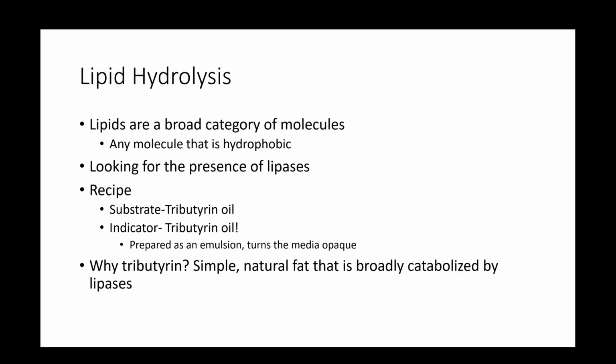Tributyrin also has a really nice aspect to it. Remember that all lipids are hydrophobic, and our media, of course, is made of water. So if we add oil to water, it's not going to mix. If we were just to put it in there and pour our plates, we would have a mess. We would have media solidify, and then we'd have oil floating on top.